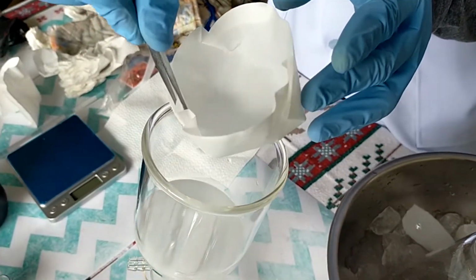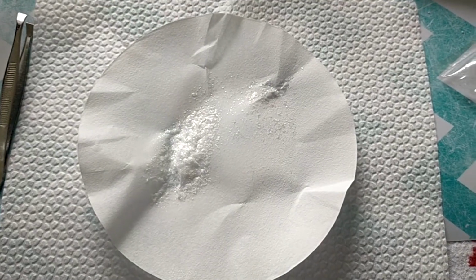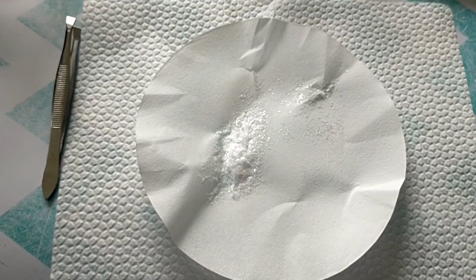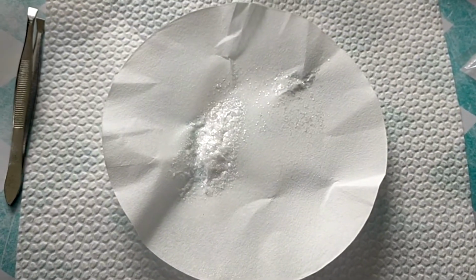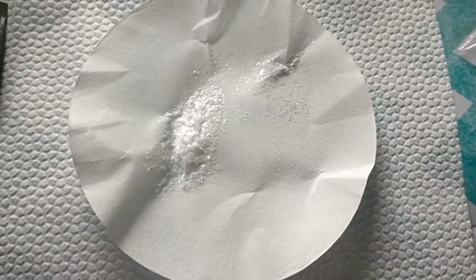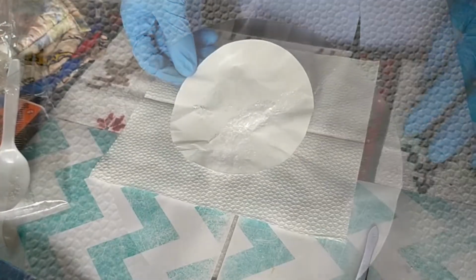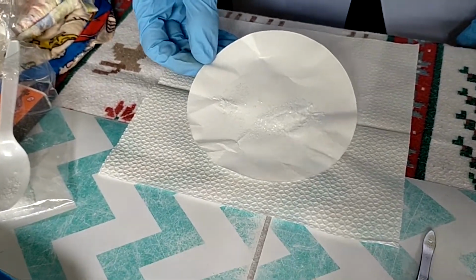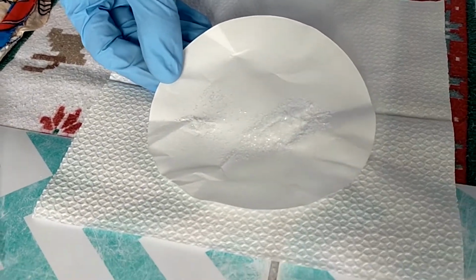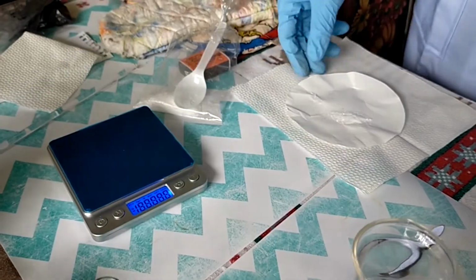Now this, of course, contains the recrystallized naphthalene. So here is our naphthalene still. We're still air drying it, and then we will weigh it. Now I have noted that the weight of this filter paper is 1.1 grams. So I will just subtract the weight of the filter paper from the weight of this whole system to obtain our recrystallized naphthalene. We will weigh this again to see how much of our original naphthalene is pure naphthalene.